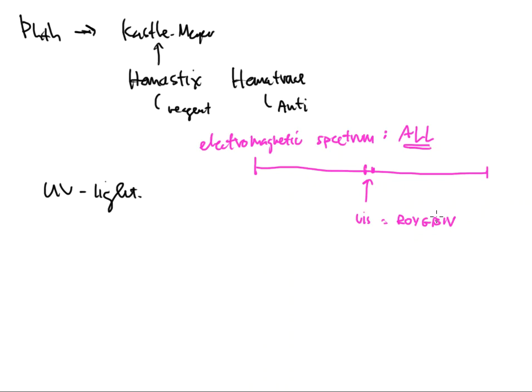Another region of this spectrum: if I look at Roy G. Biv and see the V, what's next after violet is something called ultraviolet. This is like super violet, Popeye on spinach. Ultraviolet is abbreviated with a UV, and that's the area we're getting ready to talk about in the upcoming slides.